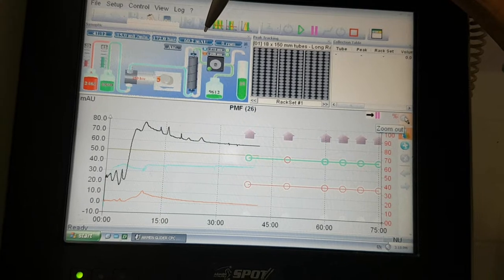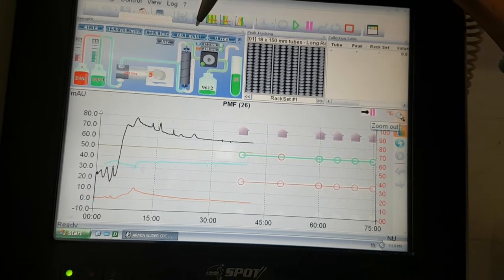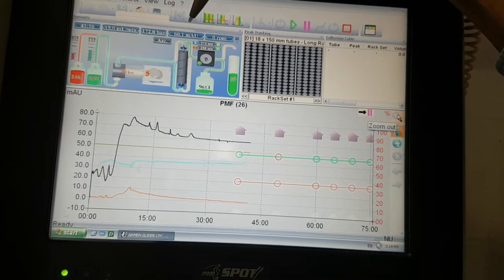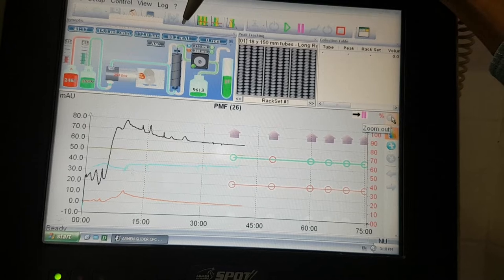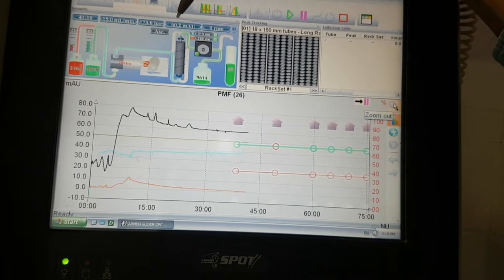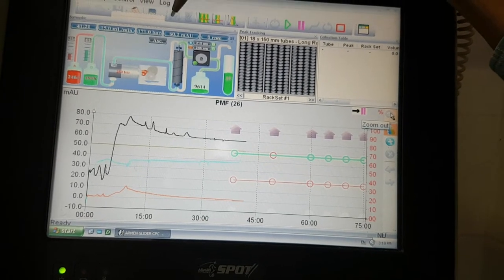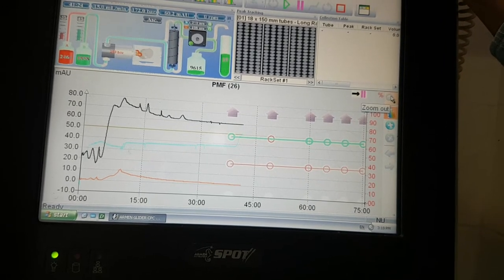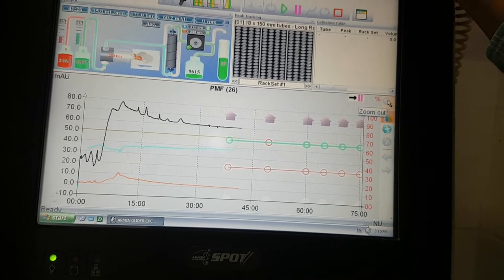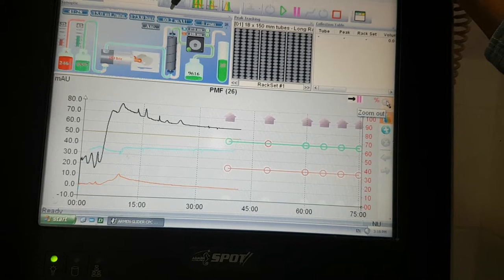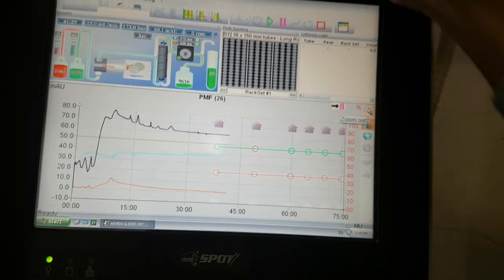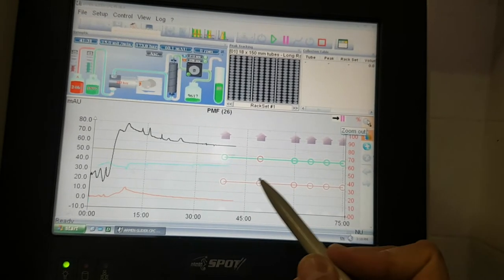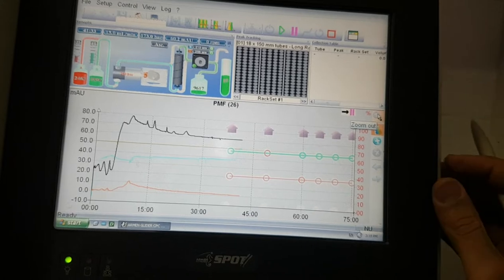It might also be that your compounds will come together even if your method that you prepared before would individually separate them and there was enough space between them, but they can come together.